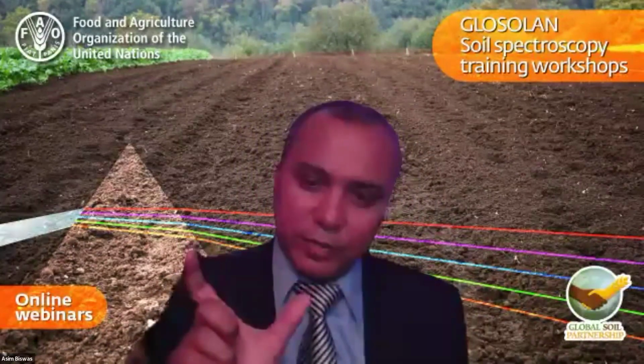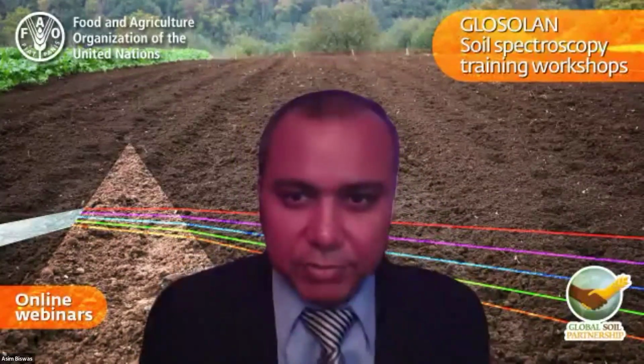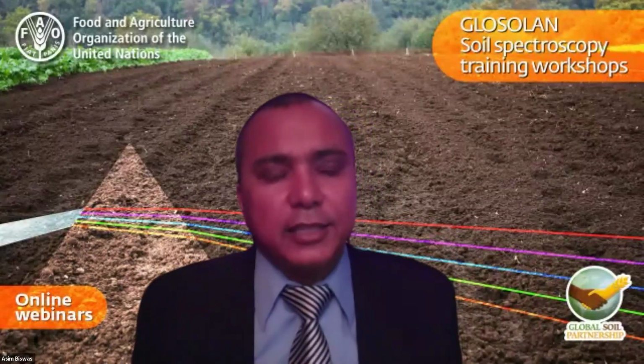Yeah, so the DS algorithm, particularly when you're looking at the overall spectral range, is about how those differences are coming. The simplest way, yes, there is some mathematical process, and these things are implemented in R. Previously, one of my postdocs, Dr. G, and her colleagues implemented, and I think it was initiated even from Bodhi's earlier work, some of those algorithms. Again, this is a little bit mathematically challenging, and often when you're working on that, we are not mathematicians. What we can do is implement those mathematical algorithms through some programming and others.